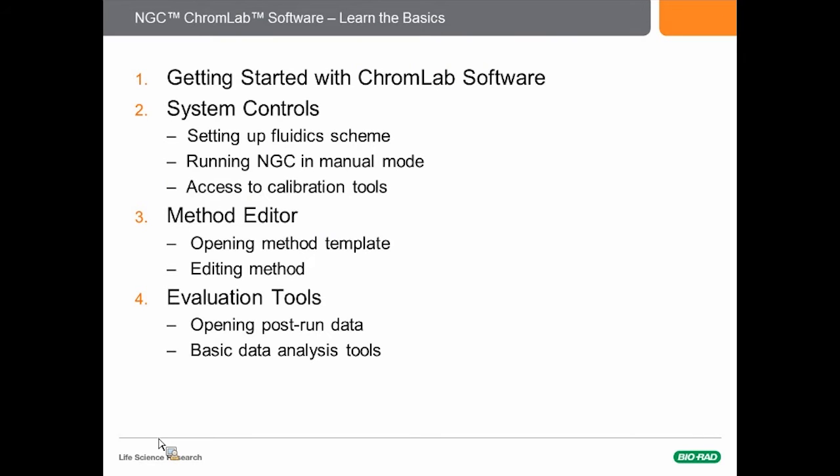Today's presentation is going to cover the following topics: getting started with the ChromLab software, after which I'll move into a discussion of the NGC system controls for operating the system in manual mode, followed by a discussion of the method editor, which is used to set up a method run. And finally, I'll provide an introduction to the evaluation tools used in the software. Now let's begin by switching views to the home screen of the ChromLab software.